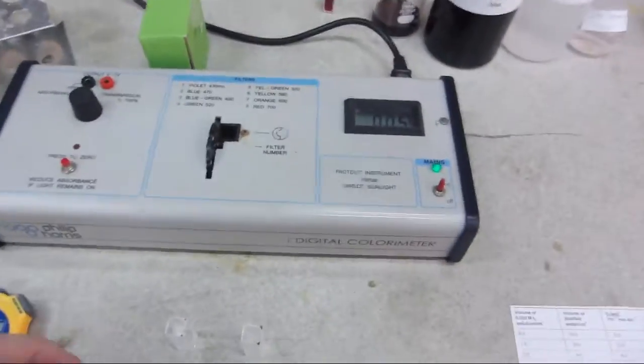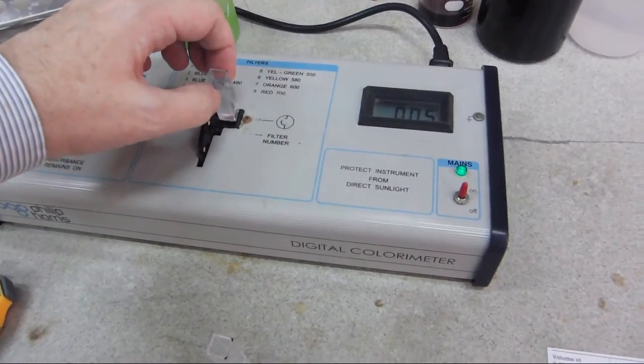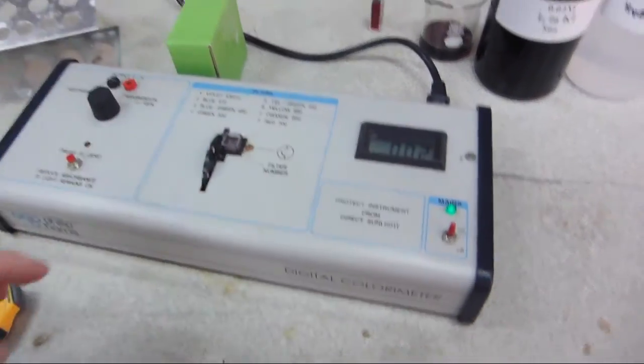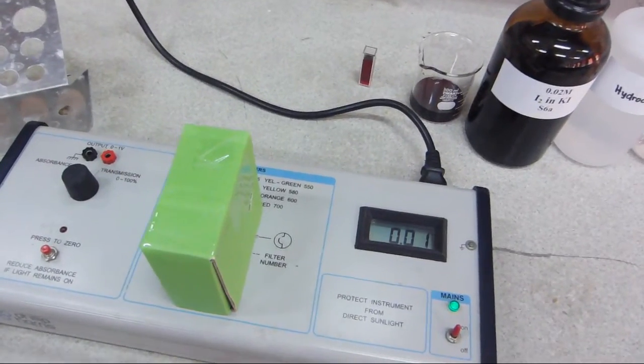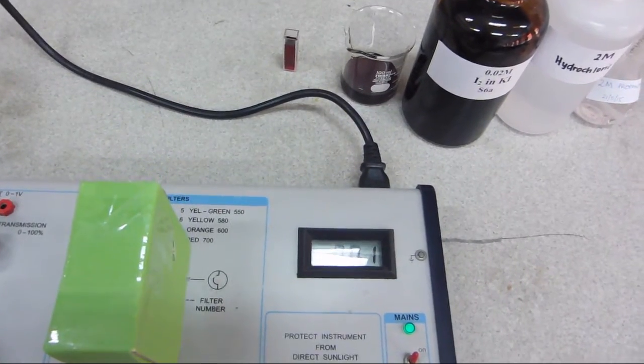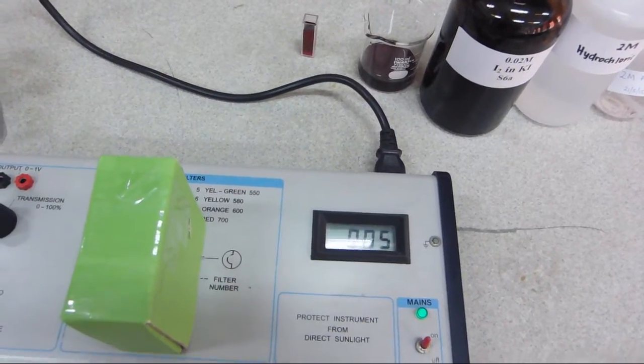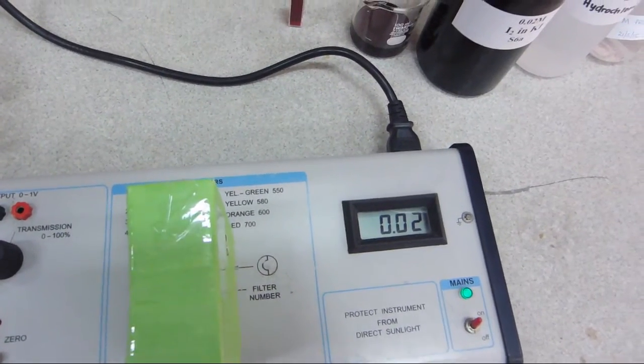The first thing we need to do is to put our cuvette, same orientation, same way round, into the colorimeter, cover it to make sure that no extraneous light is getting in, and zero the machine. You can see that we are in fact seeing an absorbance reading of very close to zero.